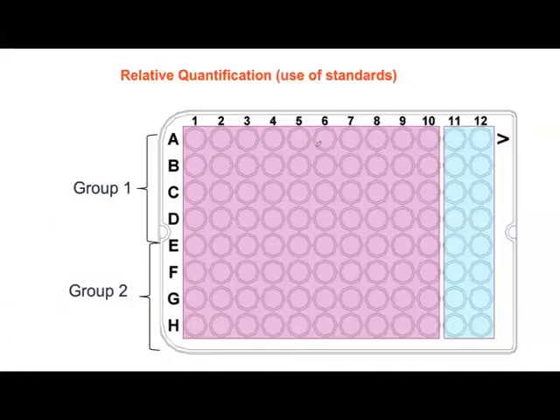Now, the other common PCR method, actually I like to use this more than delta-delta-CT because it saves me a lot of time and money. In this case, suppose that I cannot run the housekeeping gene and the gene of interest in the same plate, but I can run all my samples and groups in the same plate. What you do here is run another sample we call the standards.